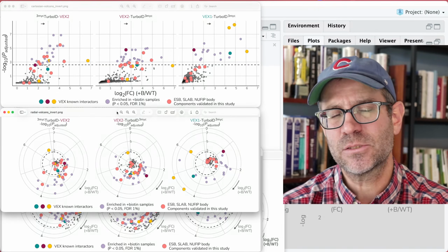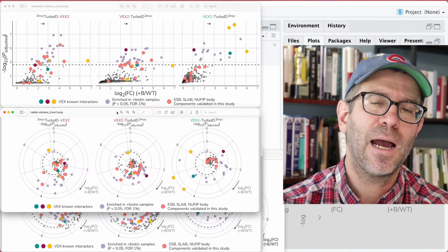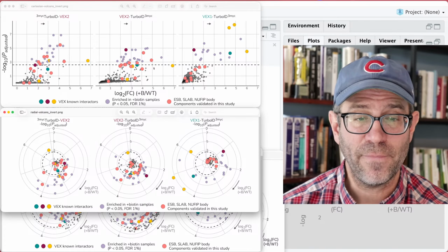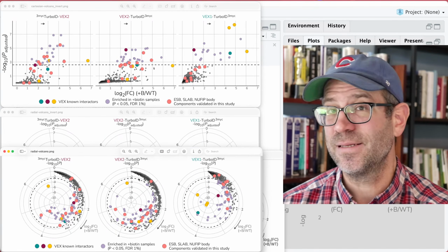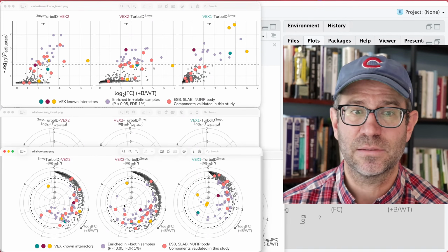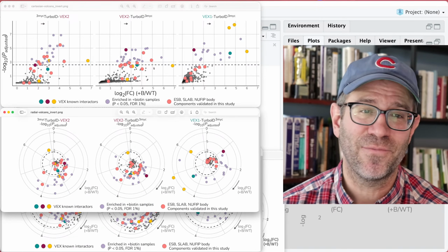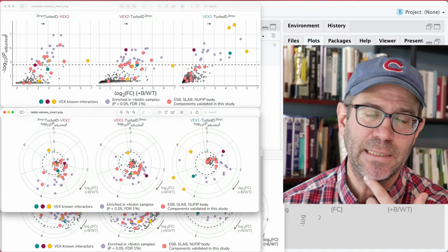And again, this question of should we be recreating plots that we don't think are good? I say yes, because ultimately this helped me to see that they were plotting the actual p-value, that they did not invert the sign of their radius axis, right? And so it probably would have taken me a lot longer to figure out how to do that if I hadn't recreated their data, right?